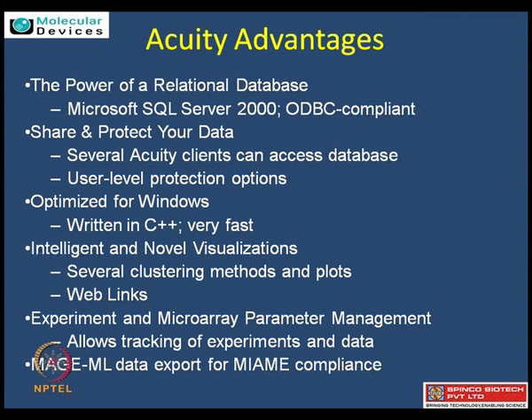So I guess the last two points which you mentioned, one is tracking the data based on the experiments, right? I think that's very important. That's also depending upon the need of the experiment. One needs to in fact track and make software learn your experiment so that one can actually apply the same knowledge for the various slides throughout to track that data set. Yes. Now, the second point which you mentioned about MIAME compliance, I think that's very important because one needs to do all the quality control checks and overall data analysis with the uniform guidelines provided. So one has to adhere to those quality control checks.